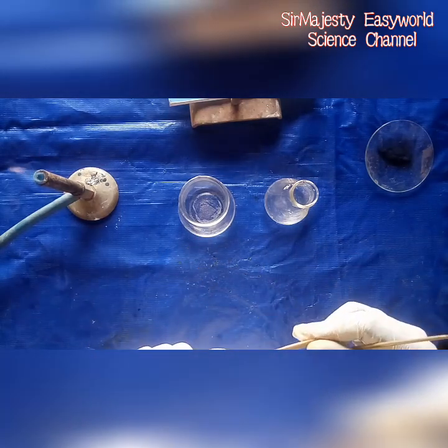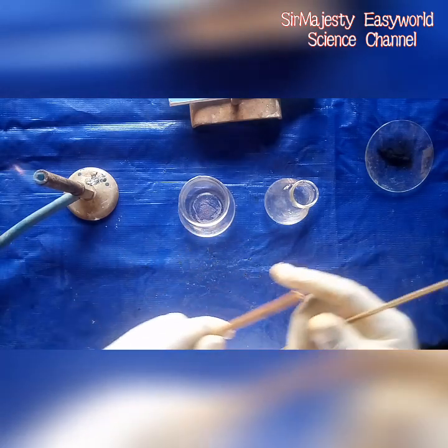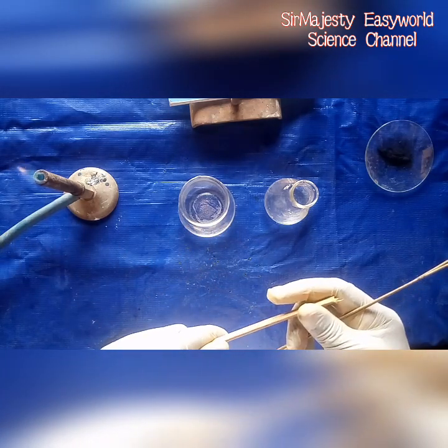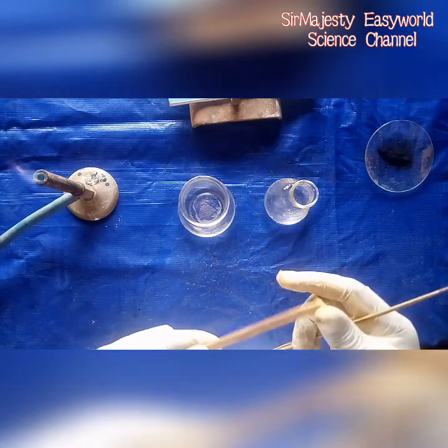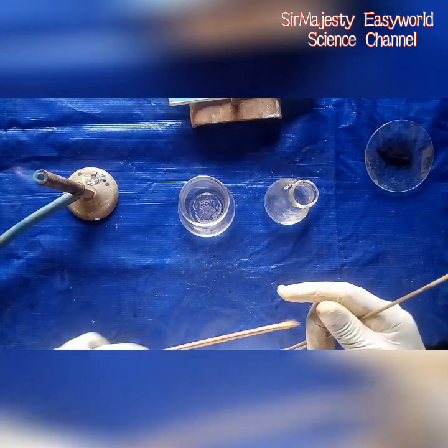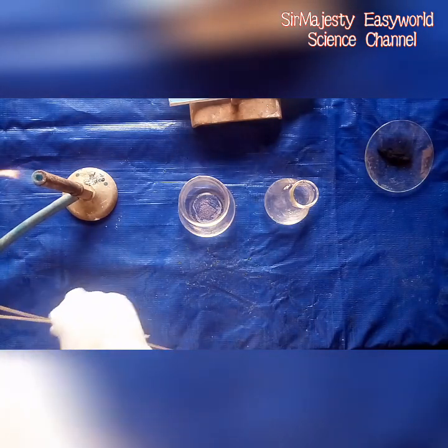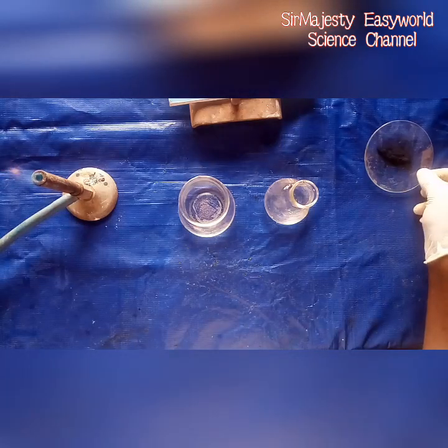We identify oxygen by having the property of rekindling a glowing splint, or relighting a splint that has gone off. So if I put off this flame, the oxygen will get it back burning again. Remember, oxygen does not burn but supports combustion — it doesn't burn on its own, but when combustion is in progress, it supports it so vigorously.